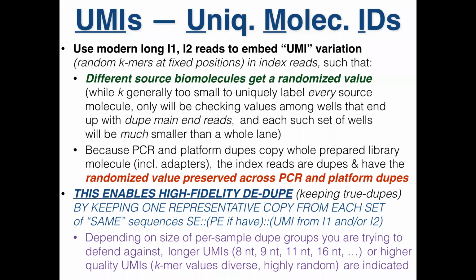Now we add the UMI, and reads that came from different biomolecules almost surely differ, with a million to one chance from a high quality, diverse UMI.